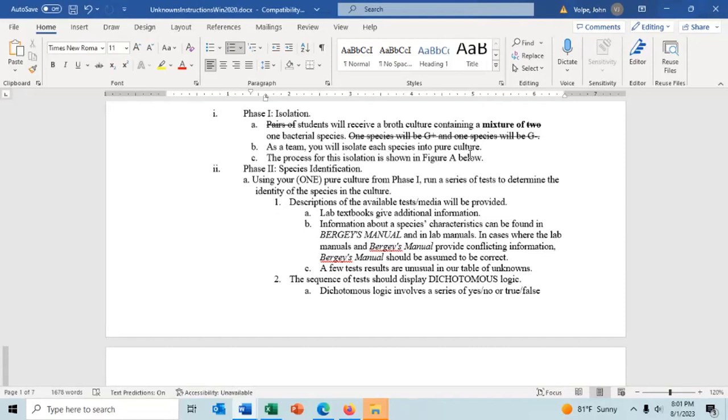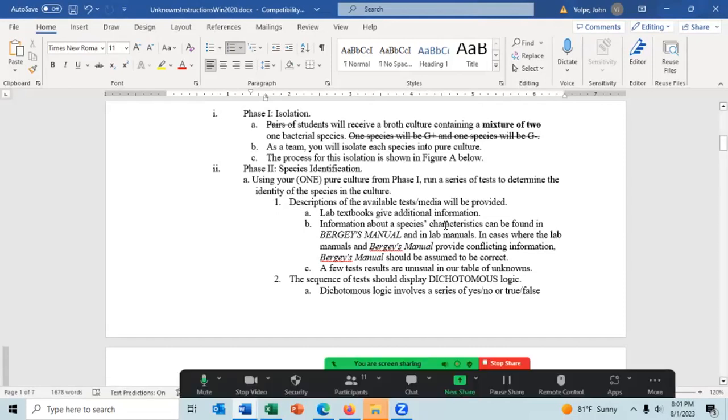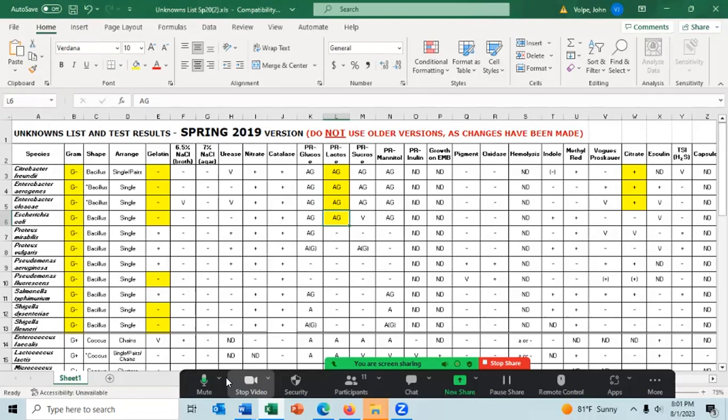It might be because in the summer term, I used one from a previous summer term, and so I don't have the most recent version. You should use the table for determining what species you have under consideration, because our table is not perfect. The table is designed to help you identify the species. I don't remember an example.